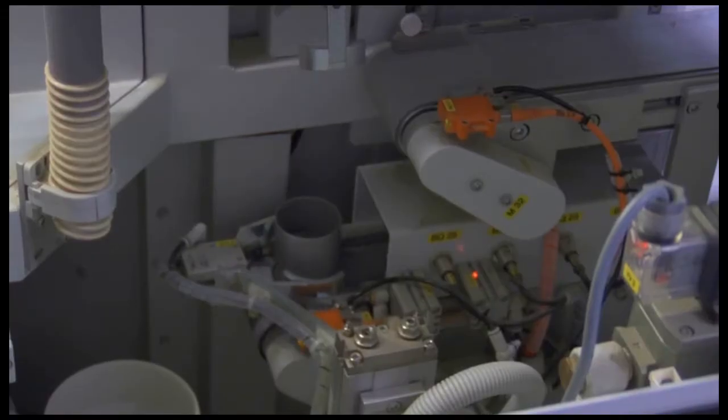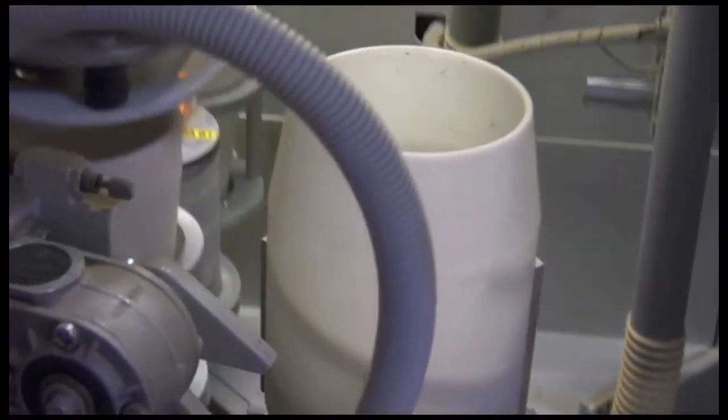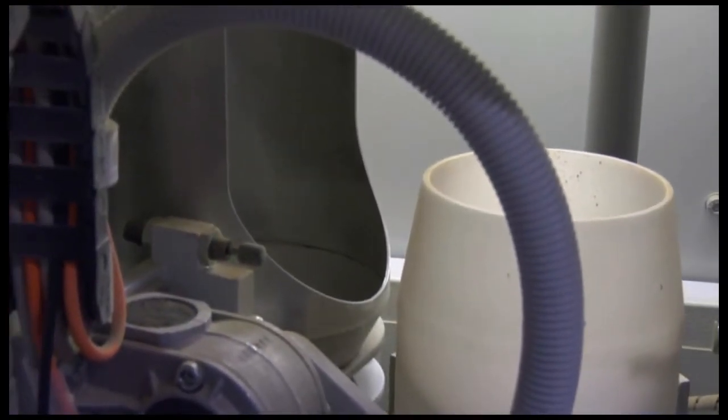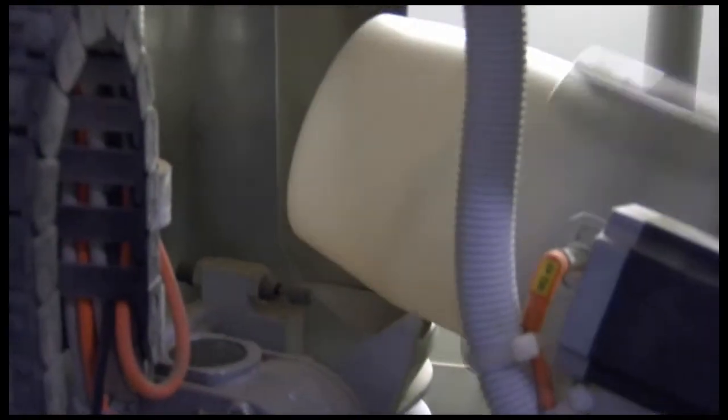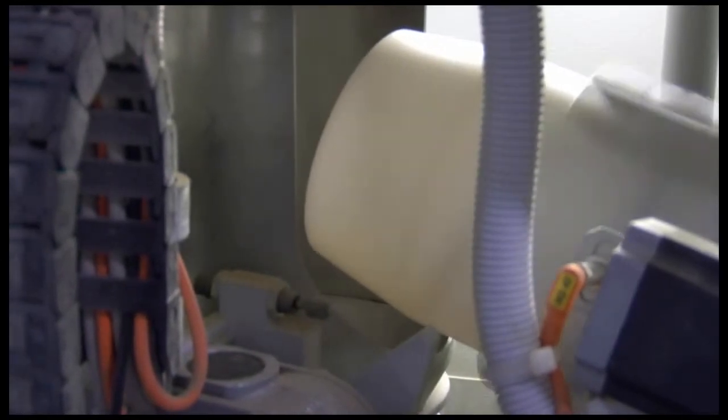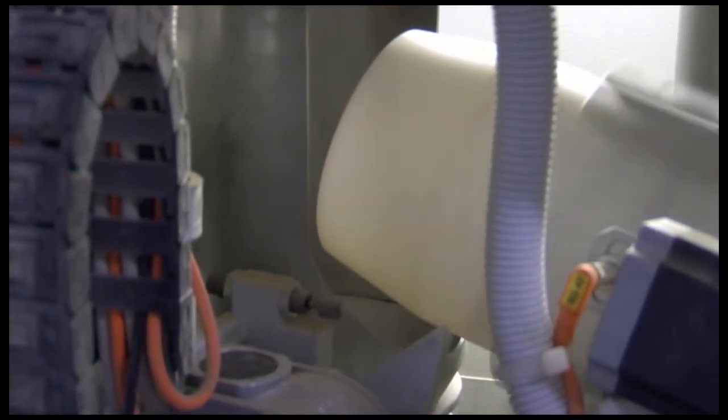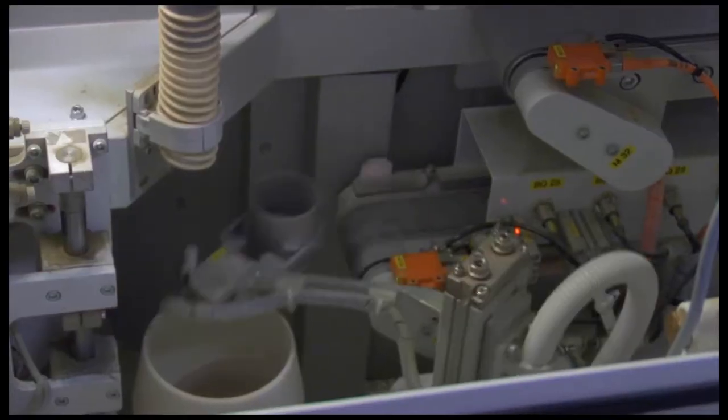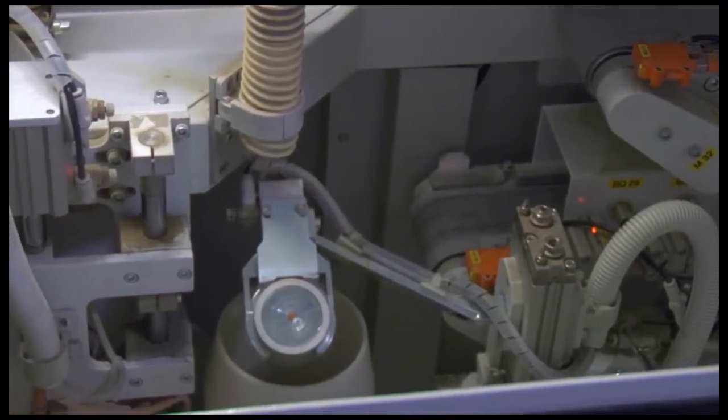In the fire assay doser, sample aliquots and fluxes are dosed in an enclosed environment, in order to get optimal, constant and stable sample mixes ready in the ceramic crucibles for fire assay. The lead dust from the flux is extracted in the machine.